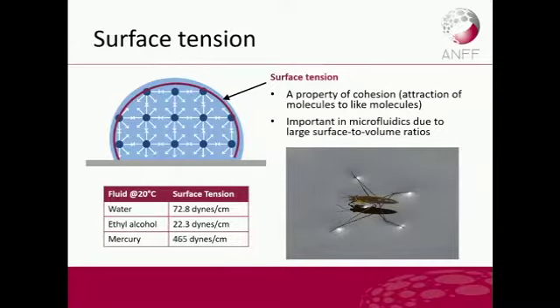Now, surface tension is absolutely critical in microfluidics, and that's due to the large surface to volume ratio that we normally deal with in microfluidics.